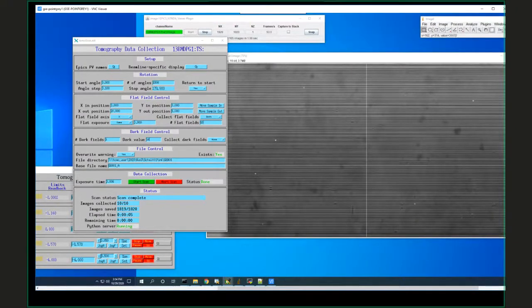And there is cesium iodide, which is even higher mean atomic number than lutetium aluminum garnet. Lutetium is very high atomic number, but of course aluminum and oxygen are not. But cesium iodide has problems in that it's hygroscopic, and so it's harder to keep it in good shape.